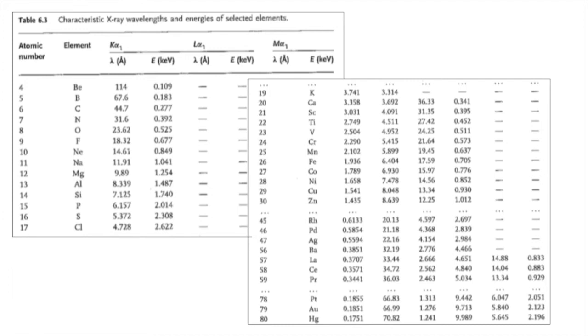Okay, so these are the values that we see. When we're looking at something like energy dispersive spectroscopy, typically when we do this in the electron microscope or externally, we take a spectrum of results from 0 up to a certain energy level.